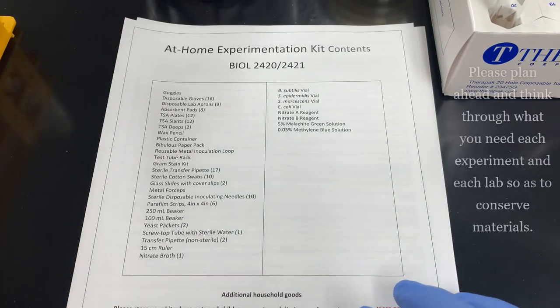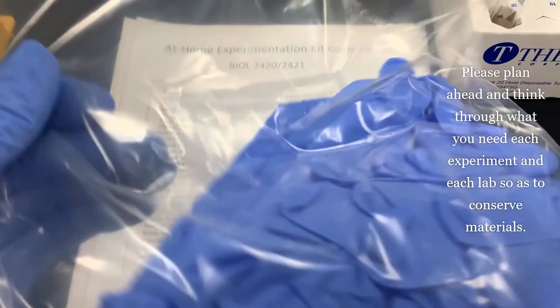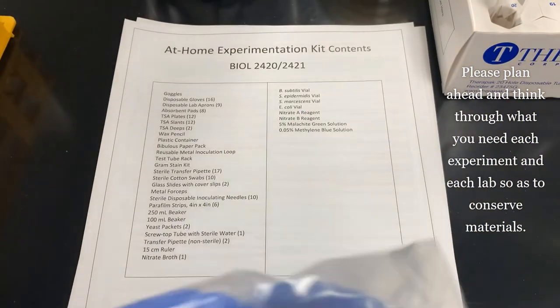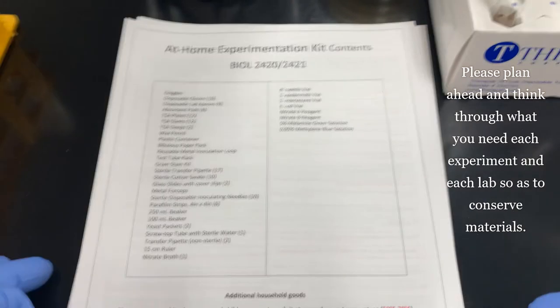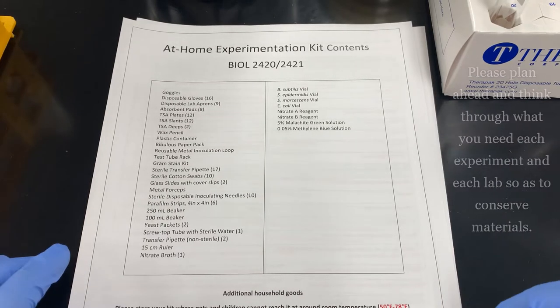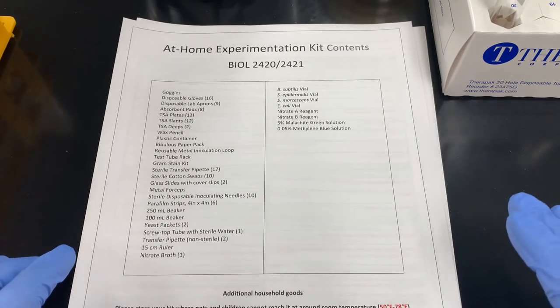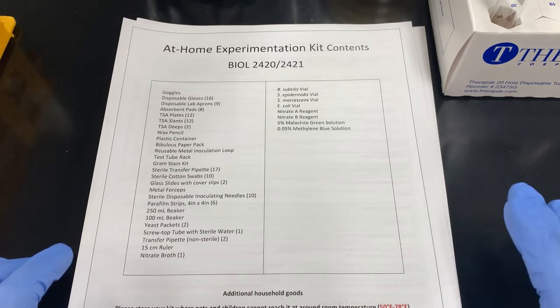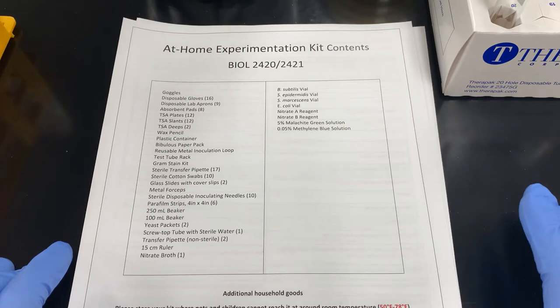Next, we're going to have disposable gloves. When you signed up, you answered what kind of gloves you needed. We're going to give you a baggie full of 8 pairs of gloves. Now, that is enough gloves for you to use several pairs per experiment. However, if you plan your time well, you should have plenty of gloves left over because you're going to do all the experiments probably in one sitting, but we did give you enough. If you need to break that up, you can.